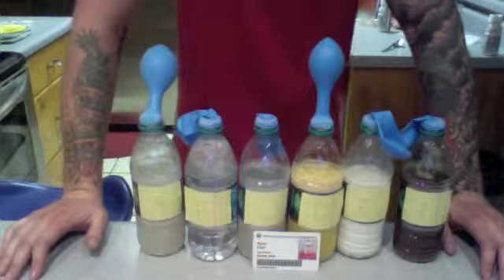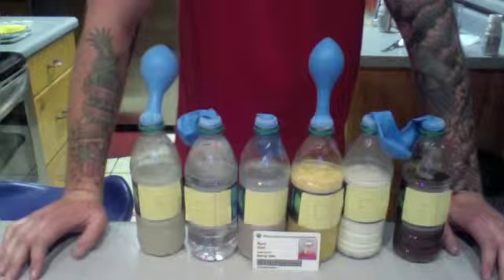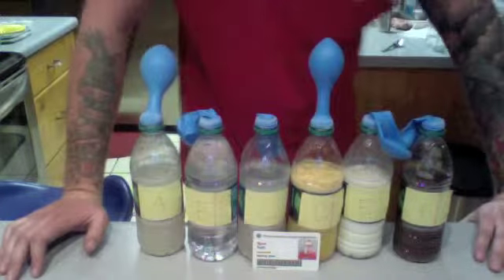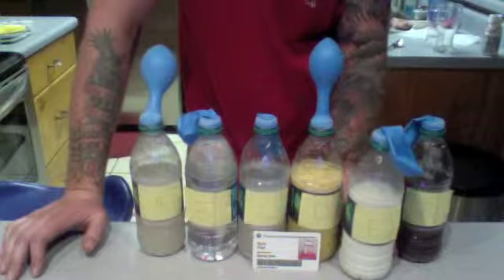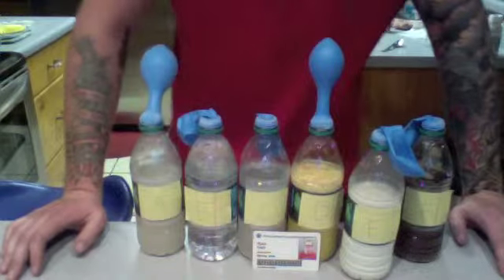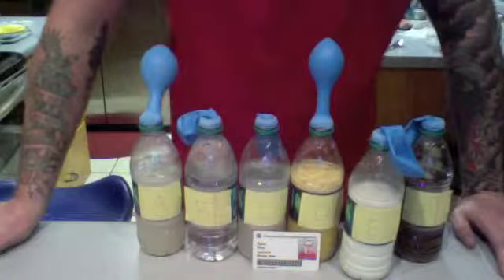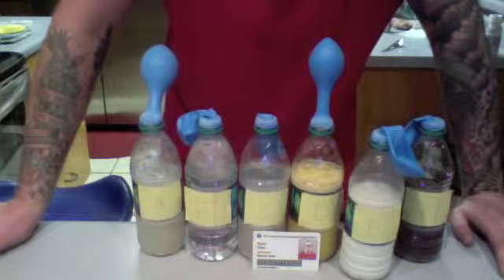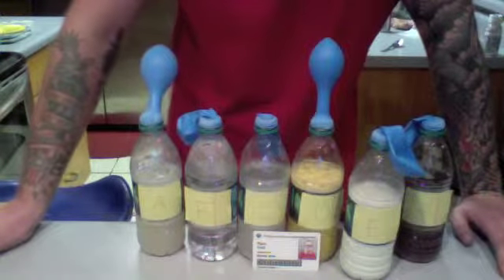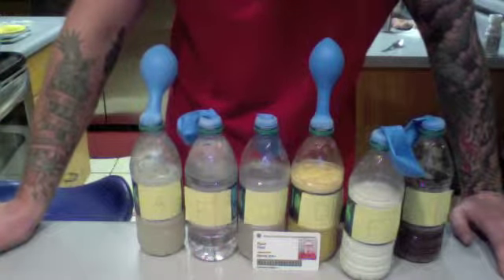Okay, so the results are in. All of my hypotheses were supported except for one. My hypothesis for test solution E, which was the milk, actually did not ferment with the yeast. I originally thought because it contained sugars that the yeast would feed off of it. However, this particular species of yeast is not able to metabolize lactose, which is a disaccharide. It can only ferment with simple sugars such as glucose or sucrose.